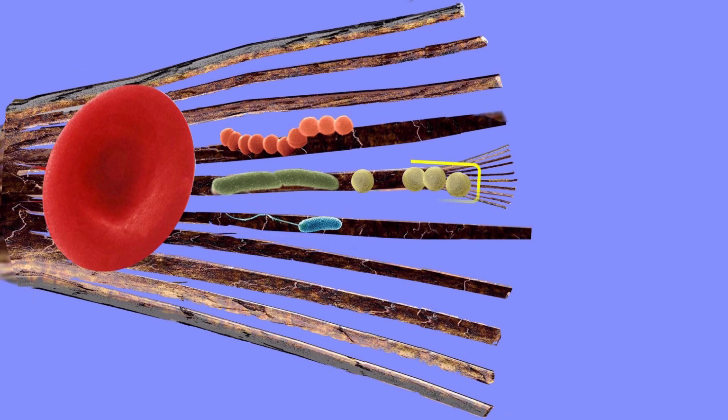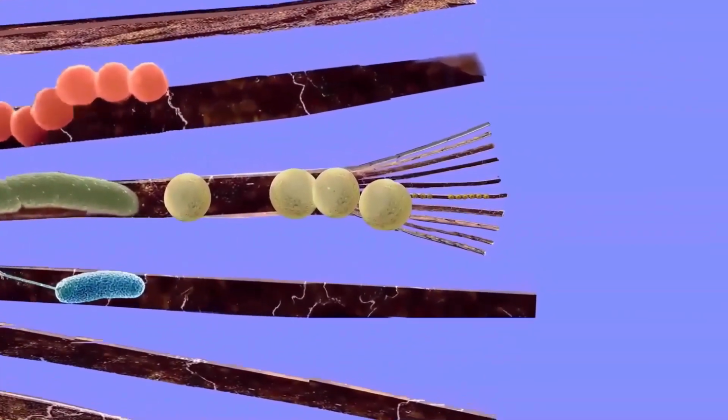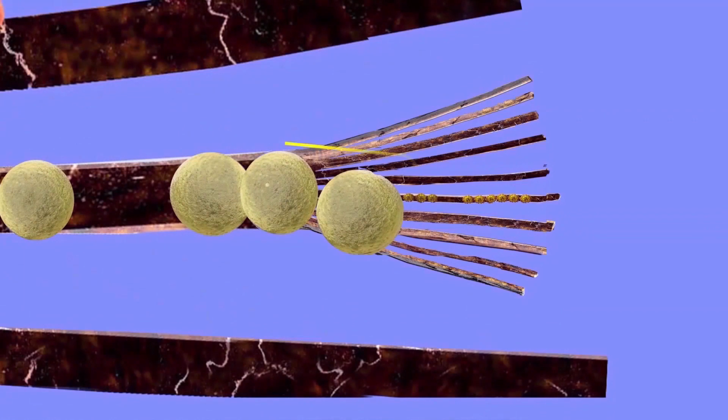And these are staphylococci, staphs. They normally occur as harmless commensals, but of course they can cause anything from carbuncles to septicemia. We can now increase the magnification until the field is dominated by these staphylococci. They occur widely in nature and are abundant on human skin, but look closer.